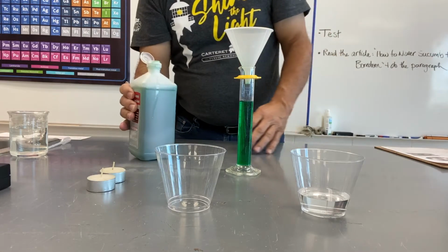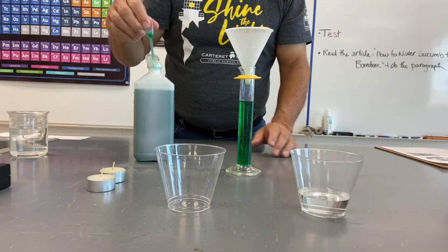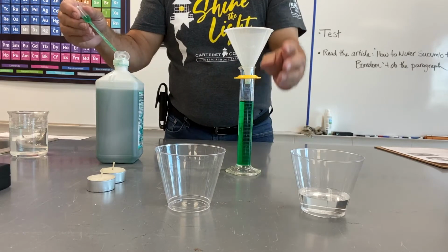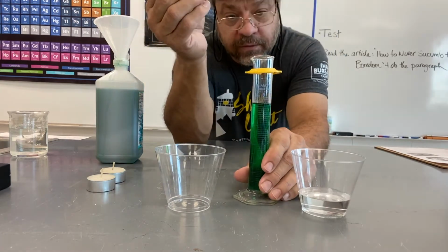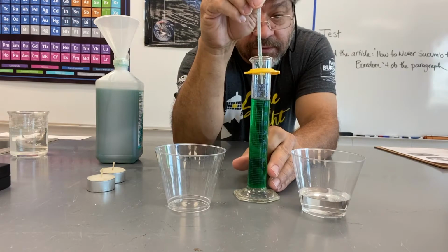Get it up close here, and I'm going to finish it up again with the pipette. Get to where I can see that. This is probably going to take more than one pipette to get to the 50.